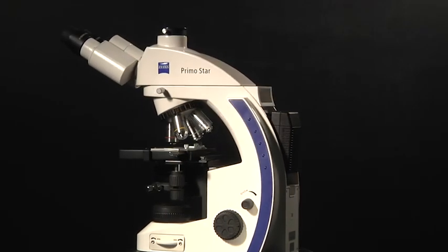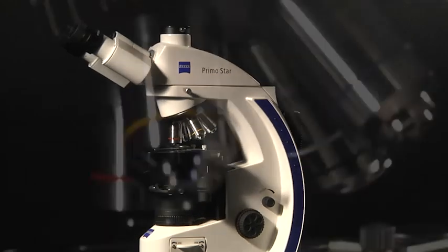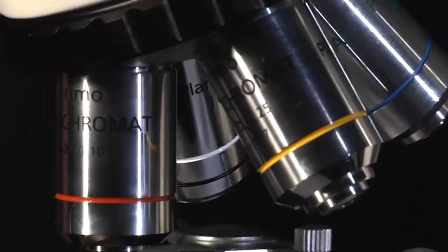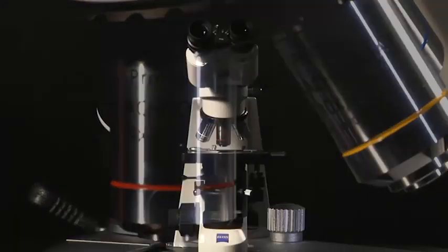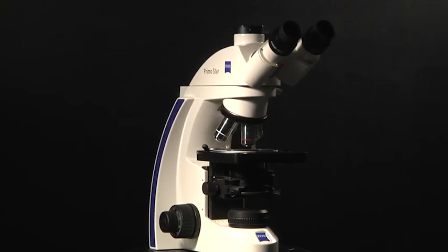A multitude of microscope types is available. Most of them are based on a transmitted light compound microscope, meaning composed of multiple lenses. The basic rules for microscope adjustment are nearly identical for all compound microscopes.